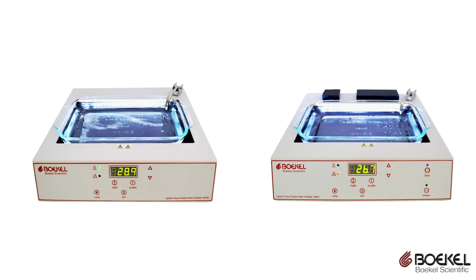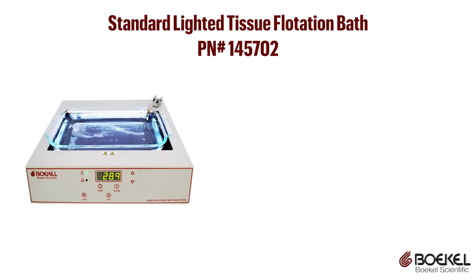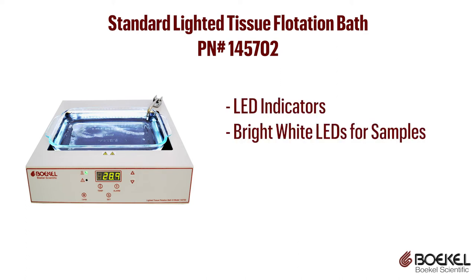If you prefer lighted tissue baths, Bocal Scientific has two models available. The standard lighted tissue flotation bath uses a digital control system and interface for precise temperature control. The unit has LED indicators, bright white LEDs for sample lighting, and a removable glass dish.